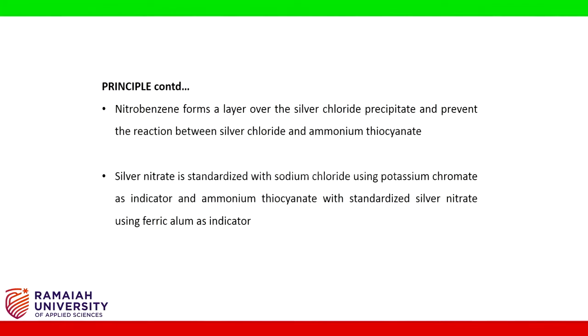Silver nitrate is standardized with sodium chloride using potassium chromate as indicator. Ammonium thiocyanate is standardized by silver nitrate using ferric alum as indicator.